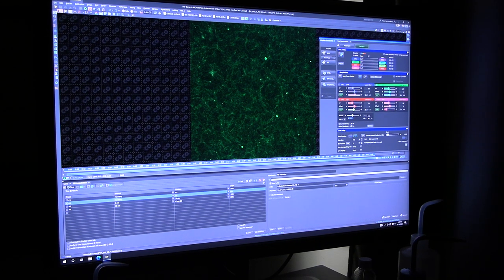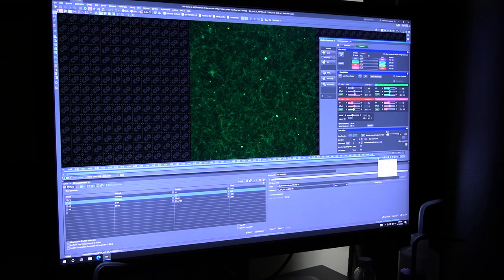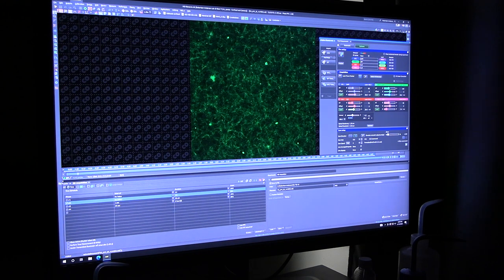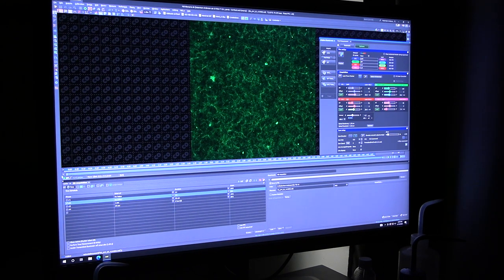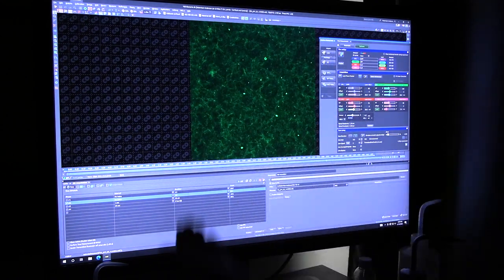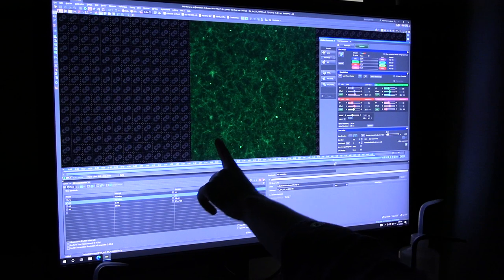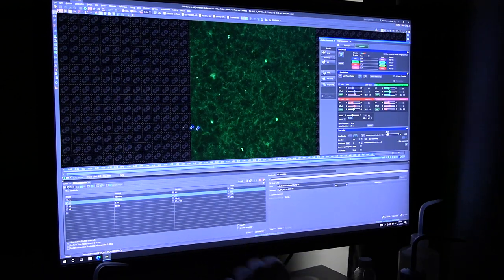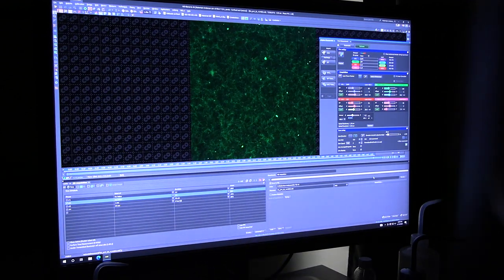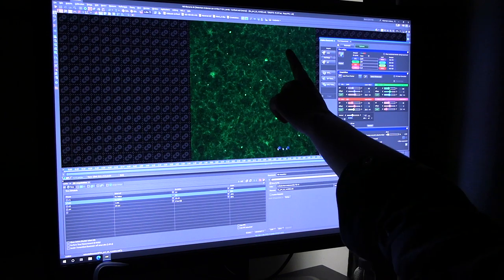A question I get asked a lot is with these active samples, how do you tell whether the sample is just drifting due to a leaky chamber or if you're actually seeing activity? With kinesin especially, it can be difficult to tell because kinesin will tend towards large-scale unidirectional motion. But one way to tell is take a five-minute video like this. You'll see that overall there's a net upward motion of the entire sample, but you also see noticeable smaller-scale events such as this part of the network clustering. You also see that the motion is not uniform across the whole field of view. For example, this part contracts upwards a little bit faster than here, and you can have larger-scale separation of different clusters of the network.